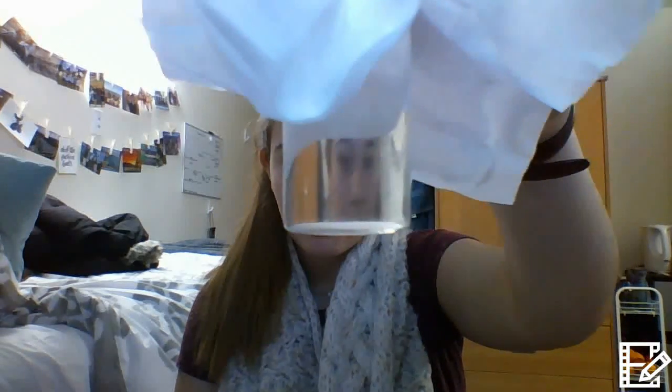In order to make the crystal growth, you essentially need to evaporate a saturated solution of alum. As of now, the crystals that have formed are very minimal in our vial. As you can see, there aren't any noticeable crystals that have come out.